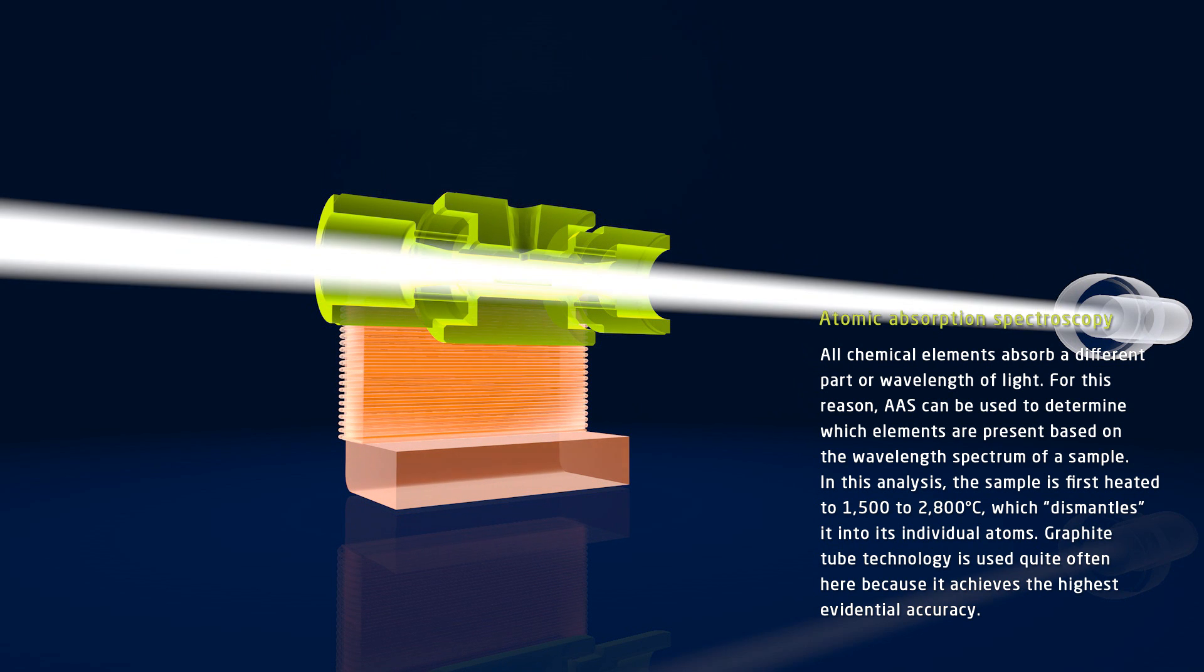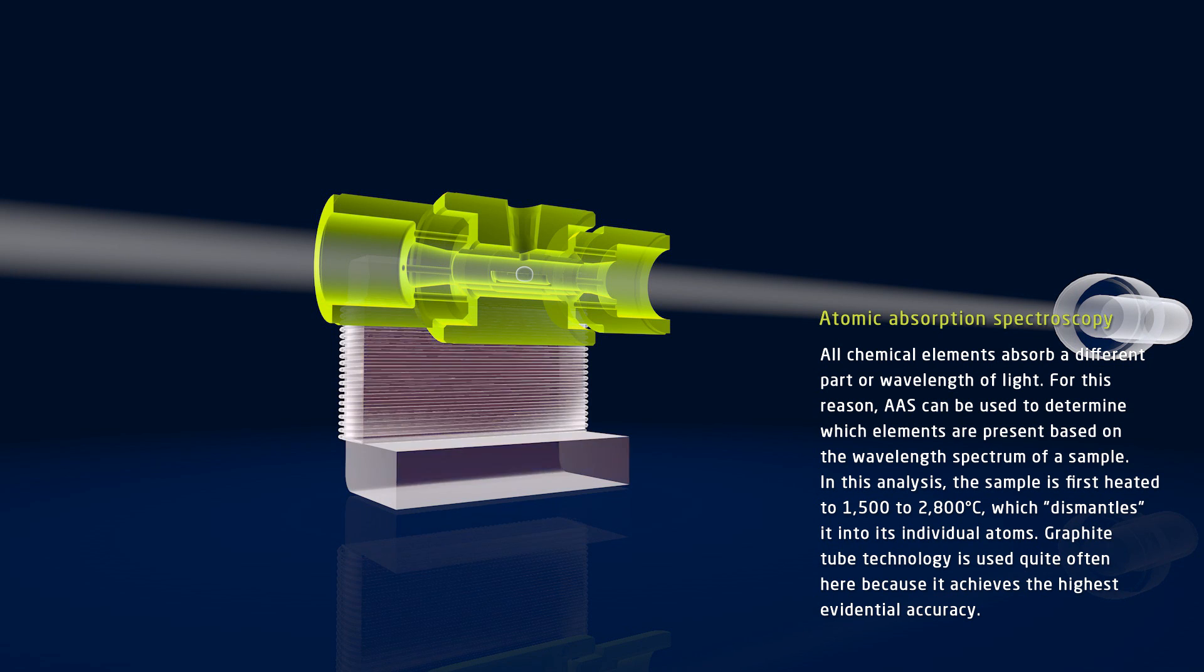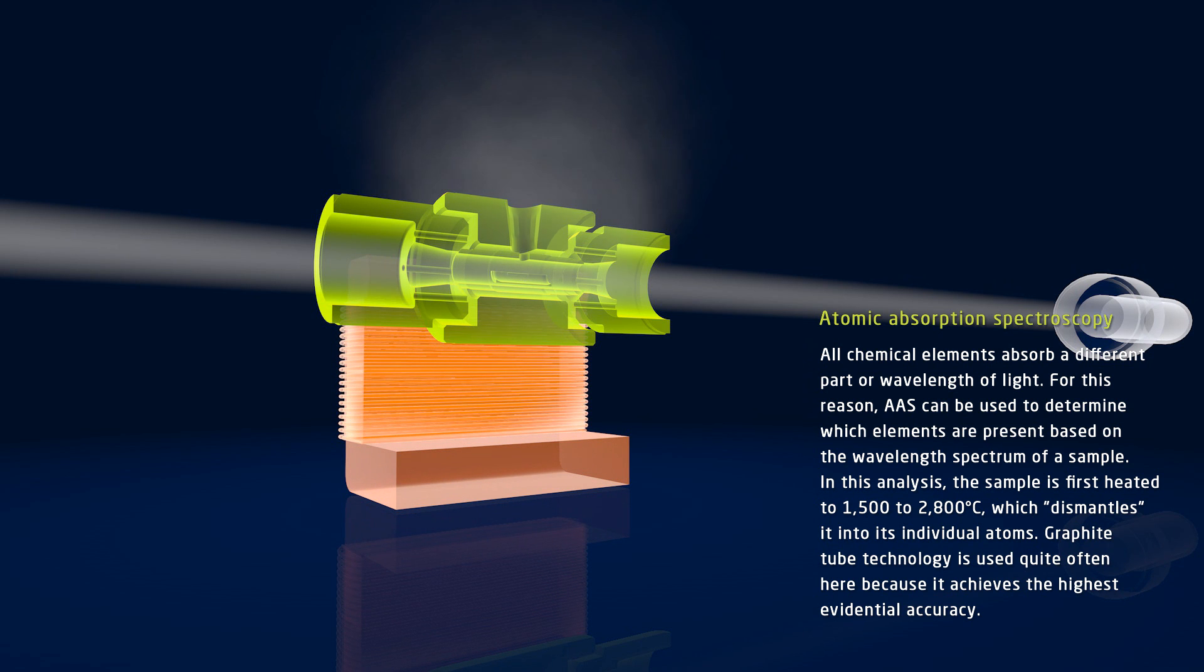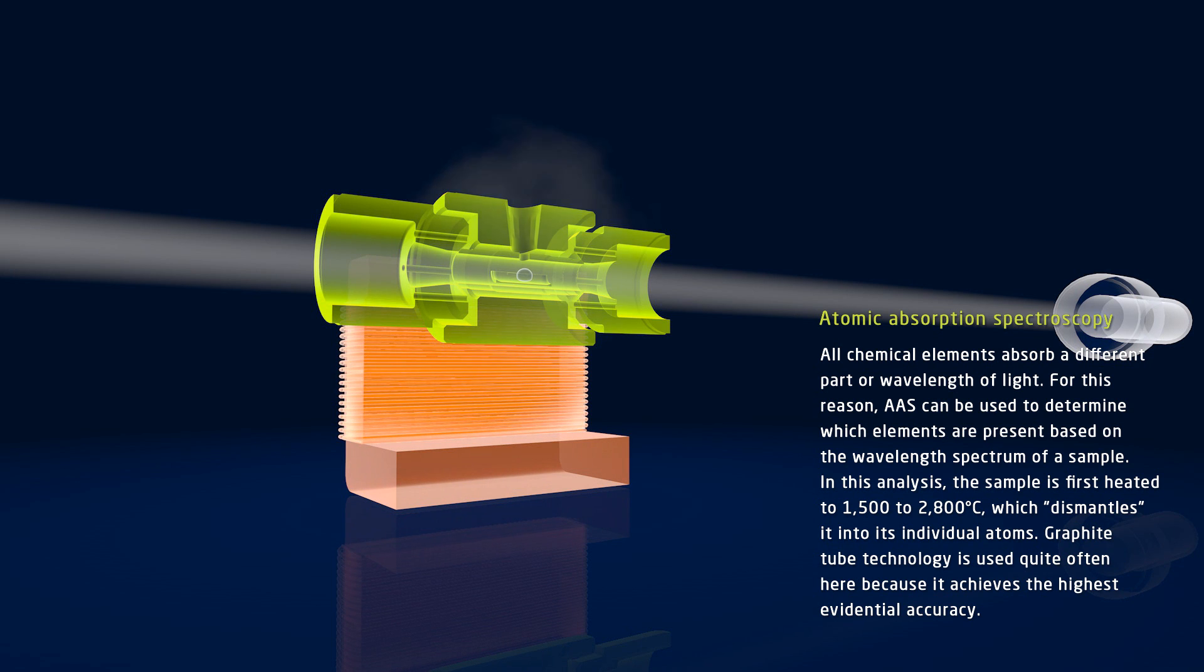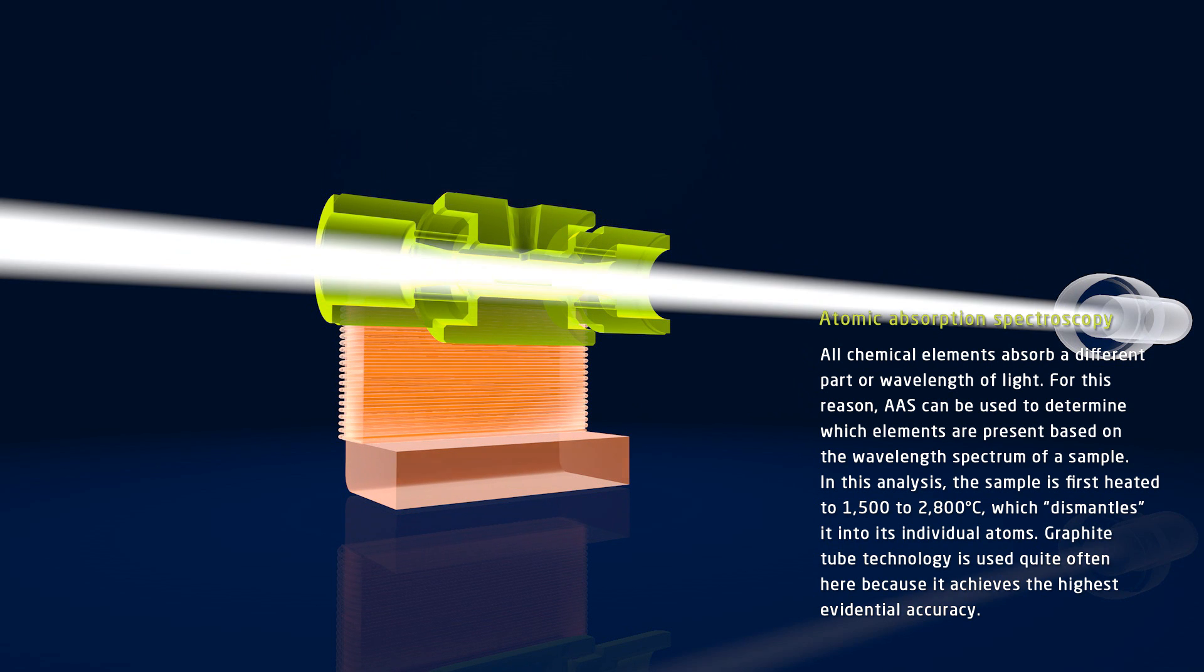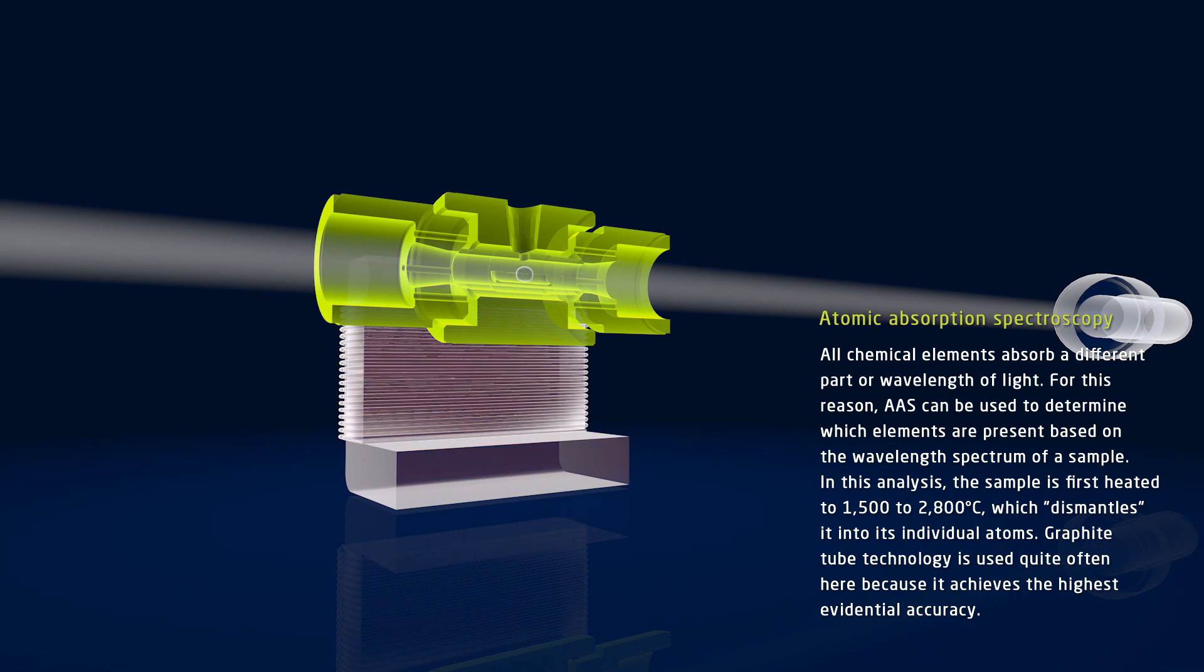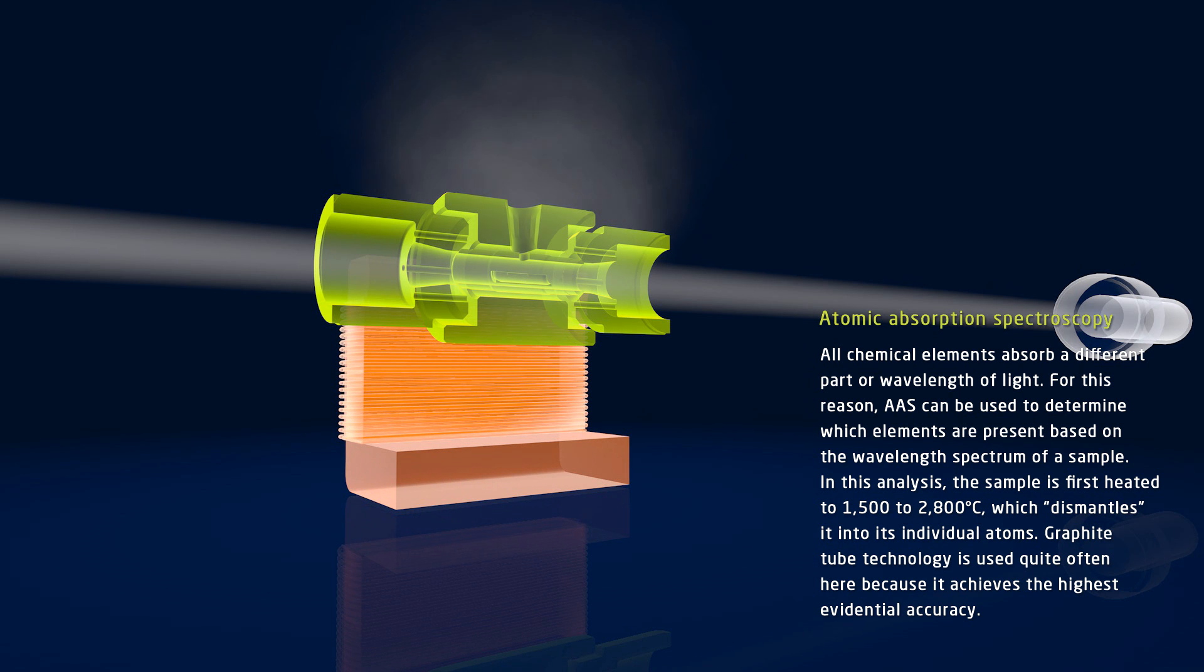To perform the analysis, the sample is first heated to 1500 to 2800 degrees Celsius, which dismantles it into its individual atoms. Graphite tube technology is used quite often here because it achieves the highest evidential accuracy.